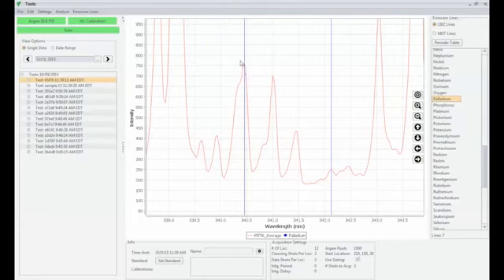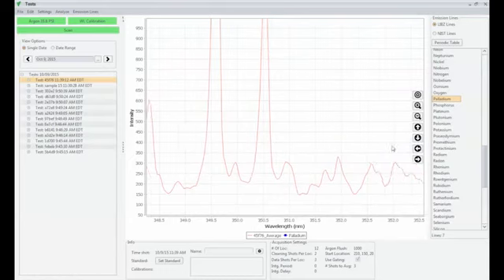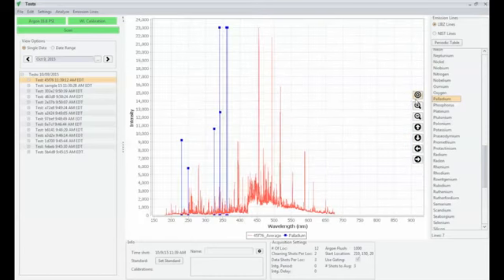It looks like this palladium line might have another peak on its shoulder, but there's palladium, there's another small palladium peak there, and we can shift over to the right a little bit, and there's another palladium peak on a shoulder. So as you can see, LIBS spectra can have many peaks involved, so it's nice to have an easy to use spectral analysis software like this to be able to really understand and analyze a spectrum.